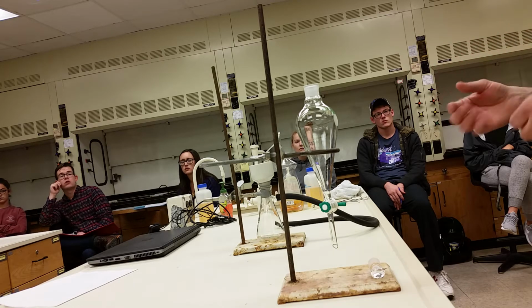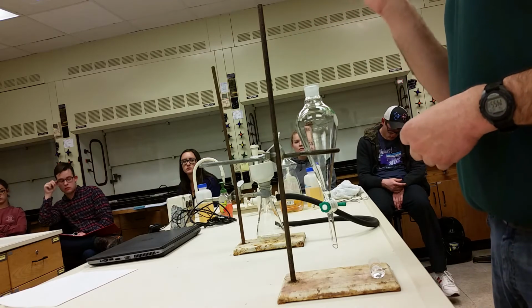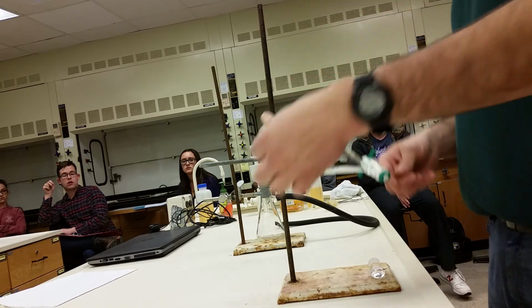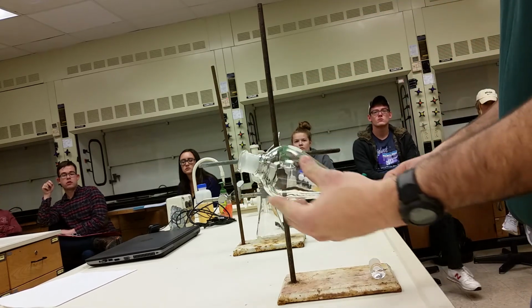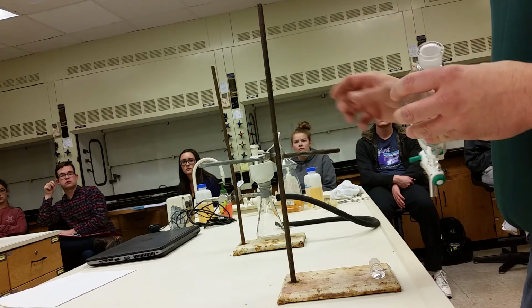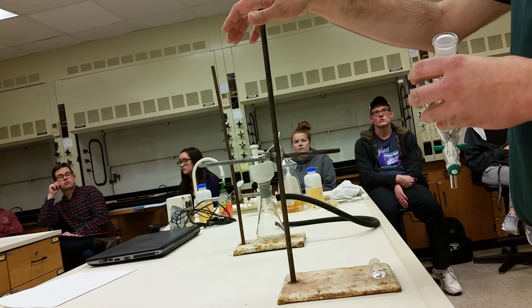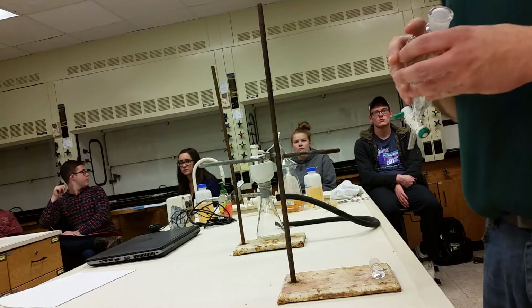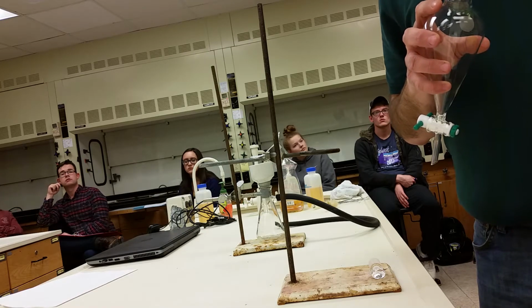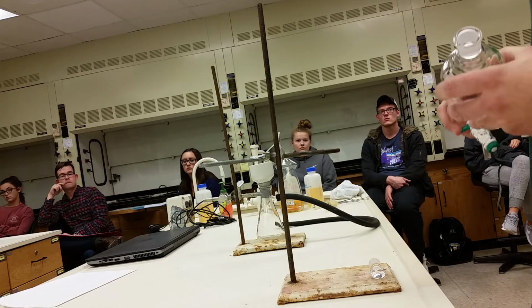Now your separatory funnel will be a 125 milliliter separatory funnel, which is in your kits. This, though, is a 250 milliliter separatory funnel. It's a lot different. It's a little bit bigger. In order to set this up, though, you'll have to have your ring stand, which may or may not be in your hood. It may be underneath your hood, or it may be in the back, standing in front of either the ice machine or the safety shower in the back.